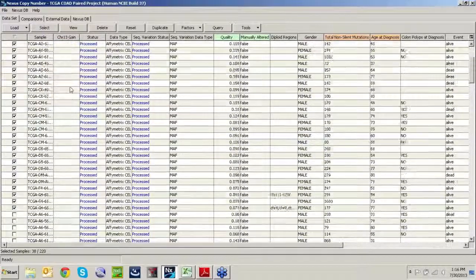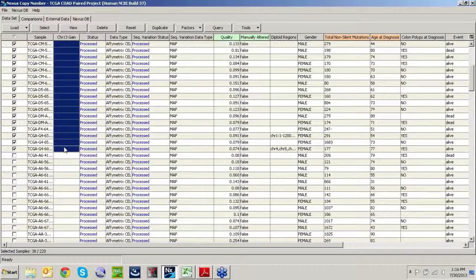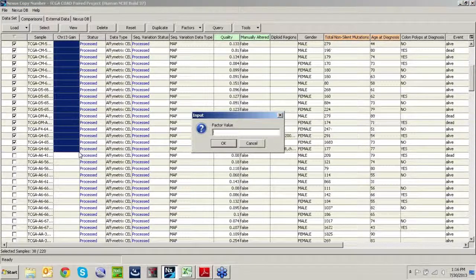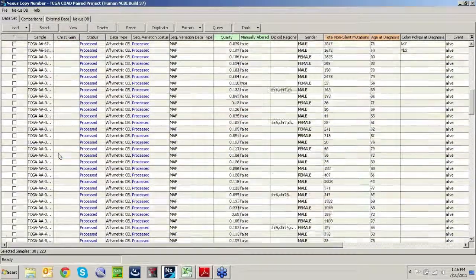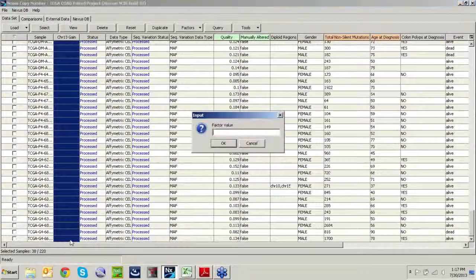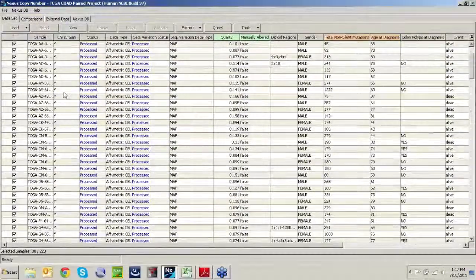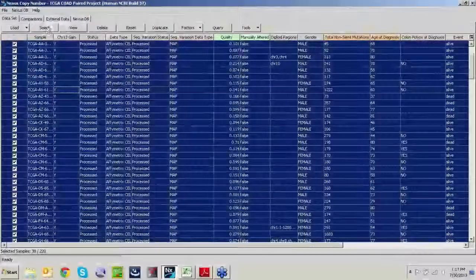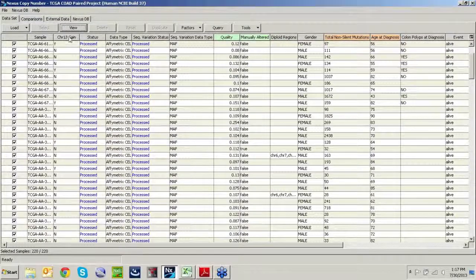Okay, so what I'm going to do now is label this first set as a Y because they have been gained. So if I select and then right-click, Set Value, Y, so those all do have a gain. Now all the rest of these do not. Okay, and so I'm going to label all those N. Okay, and so now everything has been filled in with a value. Now I'm going to do Control-A, select, to select all of the samples here and run my Kaplan-Meier analysis.